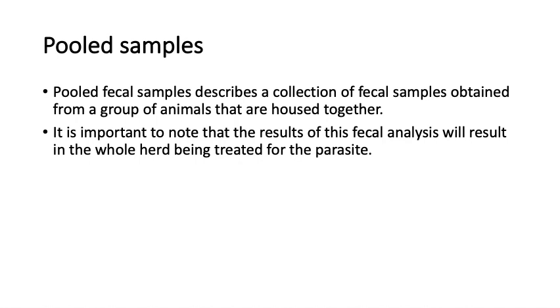For the pooled samples, no one specific individual is identified. Rather, the sample represents the group. When collecting these samples, the label should clearly state the following: the owner, date and time of collection, pen number, and number of animals contained within this pen.